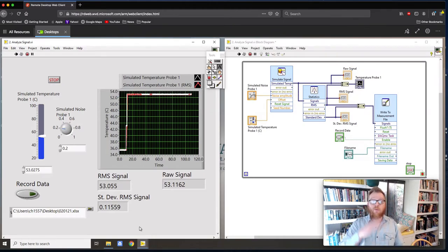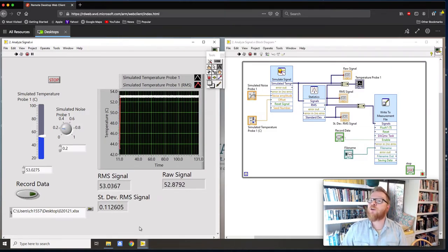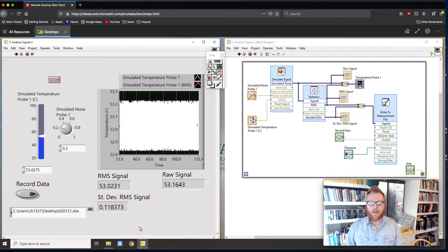Perhaps you might be running an experiment, not in this class, obviously, but for a couple of months. And you want to remember what you did a few months ago. Well, now, not only have you recorded the date, time, and file name in your lab notebook, the computer has recorded that for you as well. So if you're going back and looking at your old data, and you've taken notes in your lab notebook that says, I was boiling hexane or whatever, and this is the temperature that it boiled at, you've got all of that metadata recorded, okay?